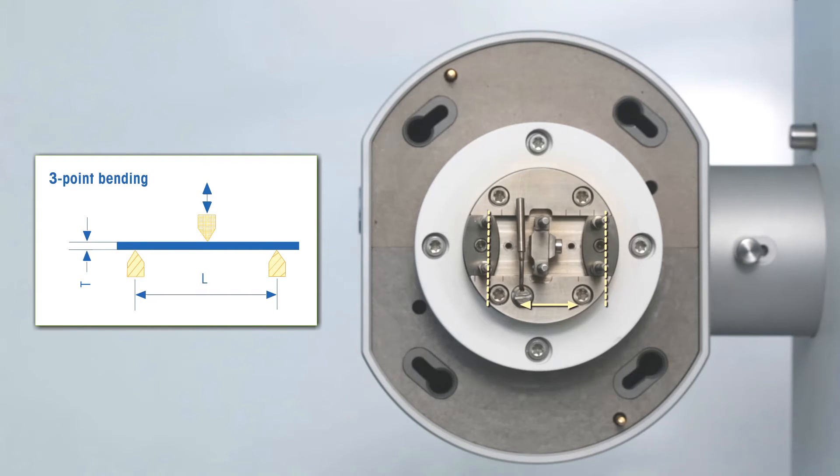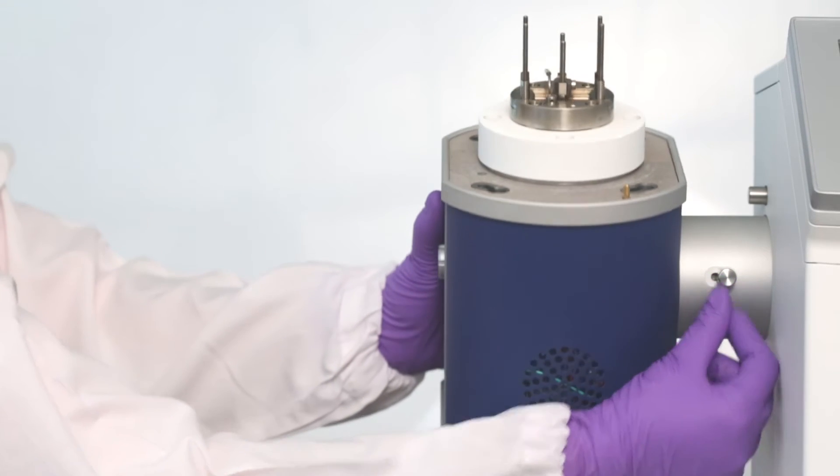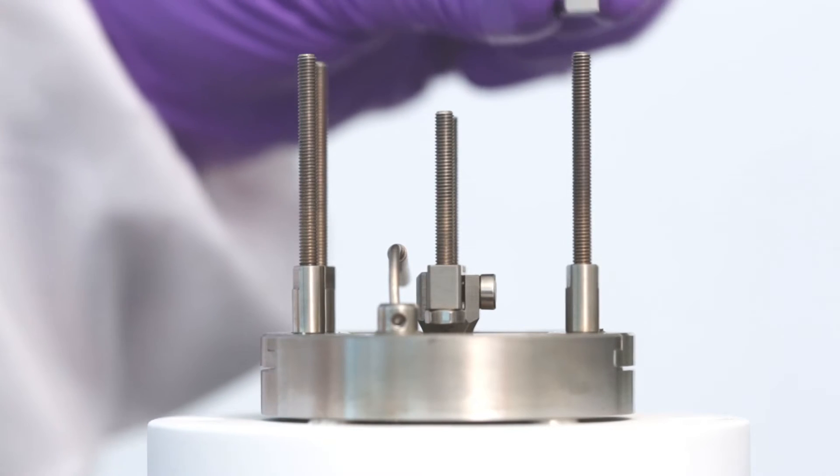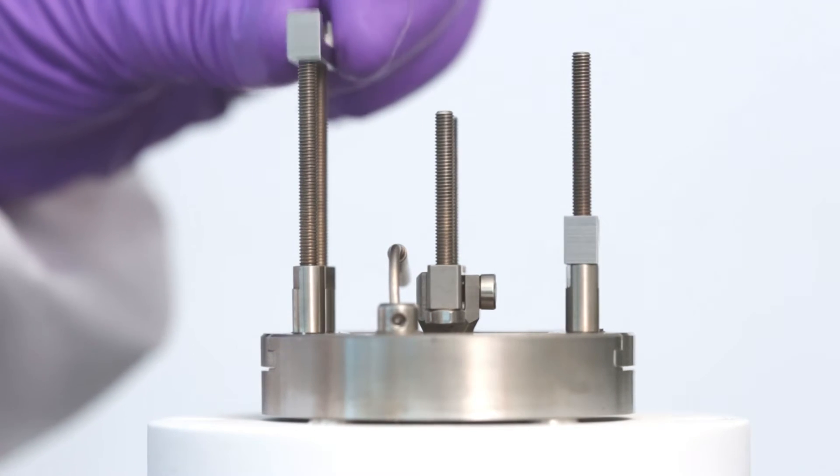The sample holder is set up for 3-point bending mode. Initially, we need to bring the measuring head into vertical position. Then, we need to fix the two outer clamp bars with the V-shaped edge facing upward with screws.